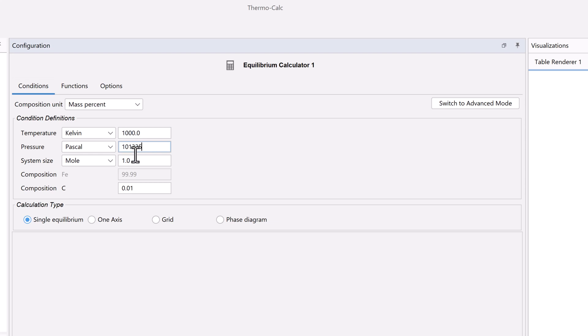Set the system size to 1 mole. For the composition, we only need to set one element because the system size has been defined, making the other element dependent.